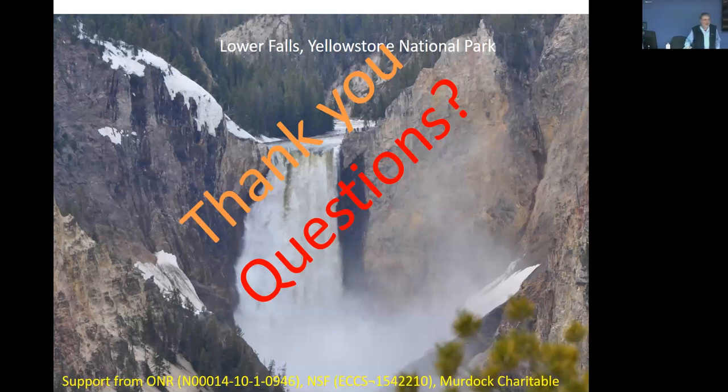Is this a room temperature apparatus? Yes, this particular system is a room temperature apparatus. We didn't have enough money to put a cryo on there, but it's room temperature. I would like to heat sometime and then do some reactions, but for the time being, it's room temperature. Doesn't mean that we cannot rig it with a heater.